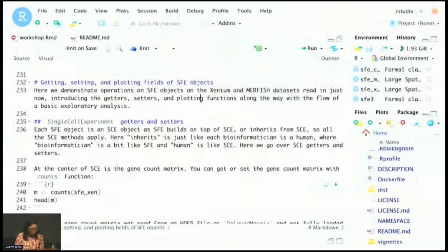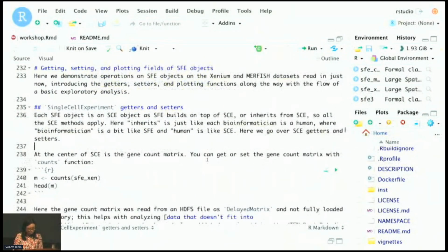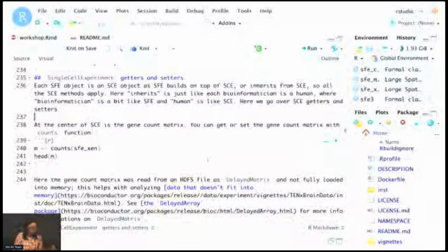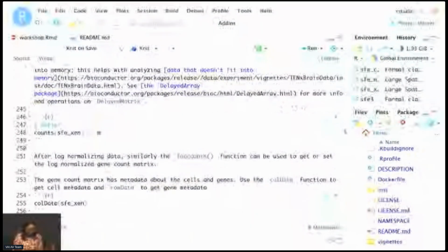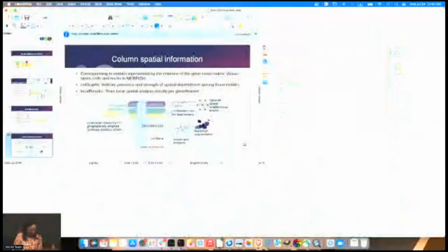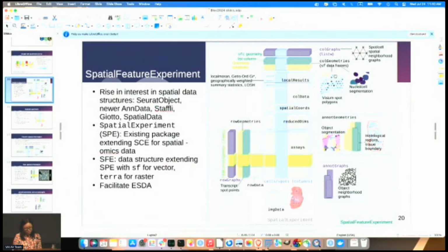So that was on constructing SFE objects, and now we're getting to operating on SFE objects and on the different fields in the SFE object.